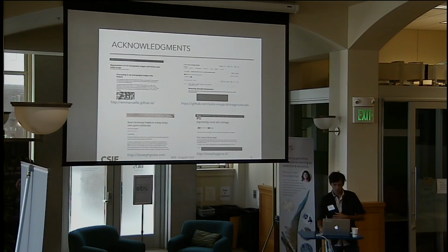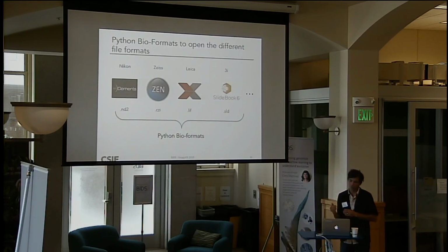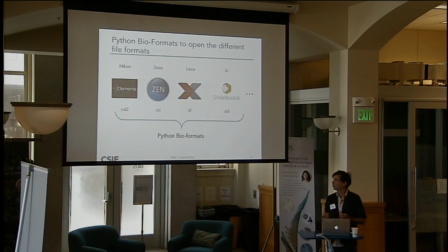Yeah, and also the different packages I've been using, so you're probably familiar with all of them. I will just mention briefly Python-bioformats, which, because I work in an imaging facility, there are different microscopes, and different companies that have all their own proprietary formats, and these types of files are kind of complicated to work with, and fortunately there are some people that deal with that, and I'm able to use their work.